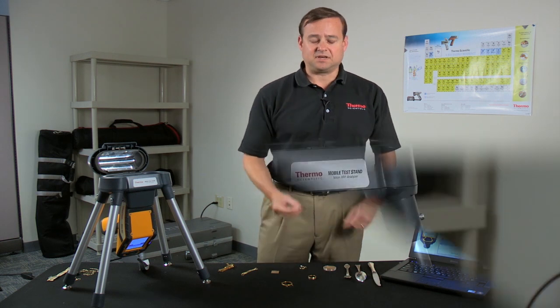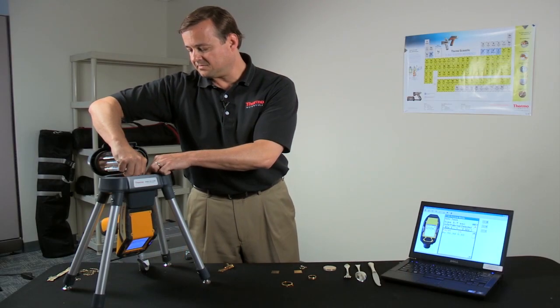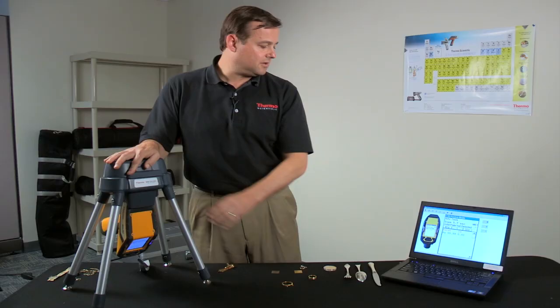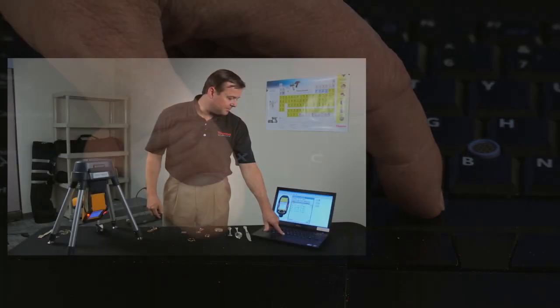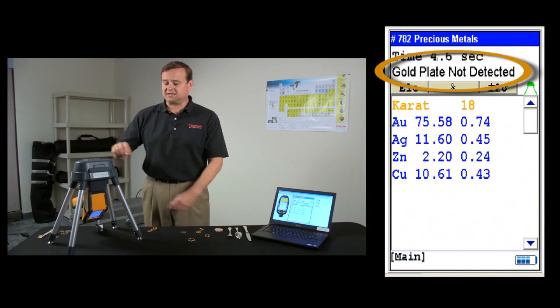So I'm going to take a couple of samples here. Here's an example of a bracelet that we will place into the test stand, close the lid, and run the analysis. Immediately it's telling you that it's 18 karat gold, and gold plate is not detected.